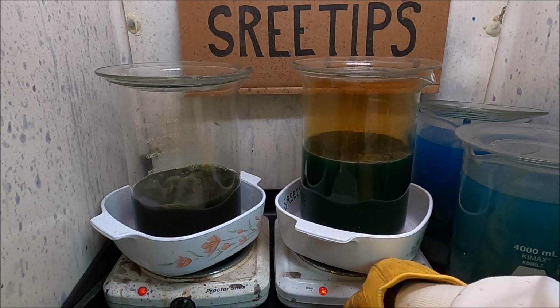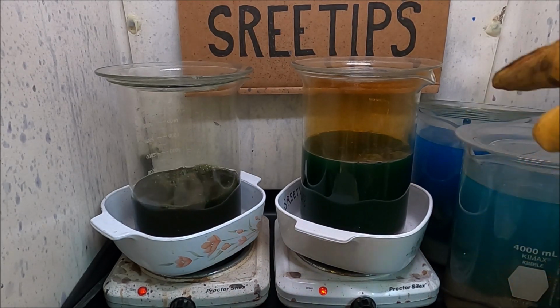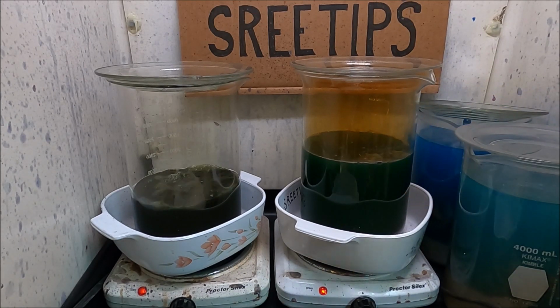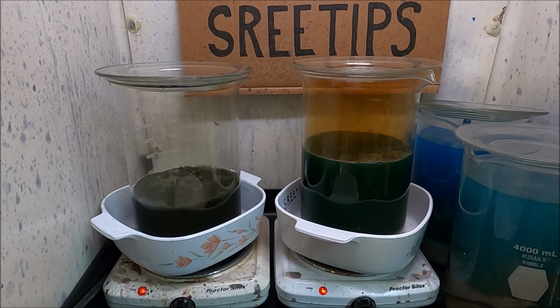I'm waiting for this one. I've got the heat up on high. I'm waiting for this one to roll. As soon as this one gets done rolling and all the fumes go away, I'm going to do the same thing with this beaker. Then we're going to call it a night.